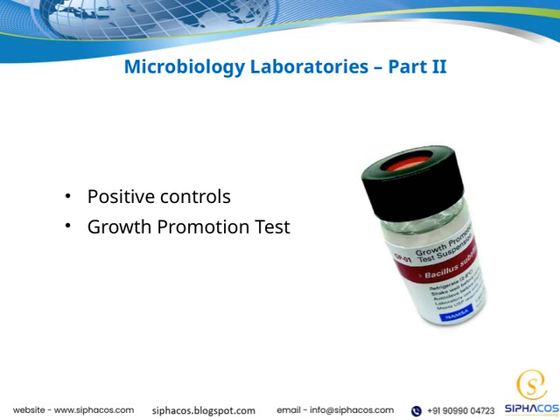Now, let's move on to slide 11, which covers positive controls in the context of the growth promotion test within microbiology laboratories, Part II. Positive controls are a fundamental part of our testing process because they help us ensure that our methods are working correctly. When we include a positive control, we're essentially using a sample that we know should produce a positive result. This confirms that our media, incubation conditions, and detection methods are all functioning properly.